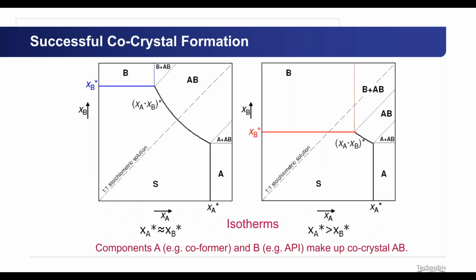Oh, I see. I do not have the reference here. I will add it before I share all the slides with you in an email in the coming days. This is actually a part of an article of Professor Joop ter Horst many years back. We also have a webinar on this, on what actually he was doing. He was looking for an optimal, successful way to make co-crystals.